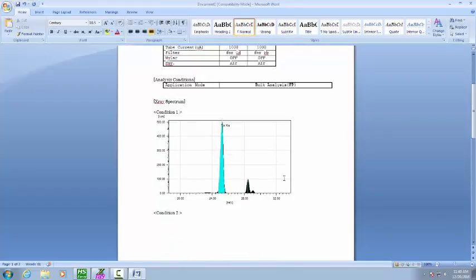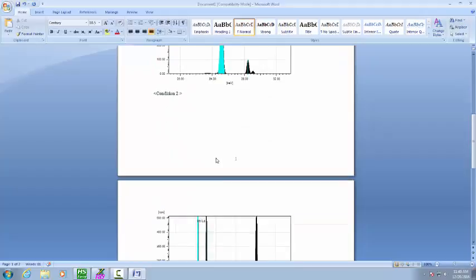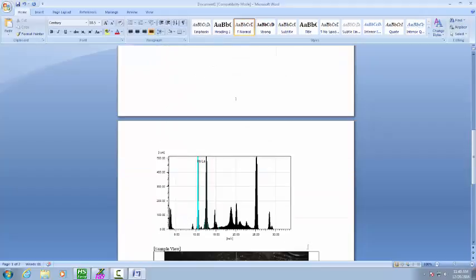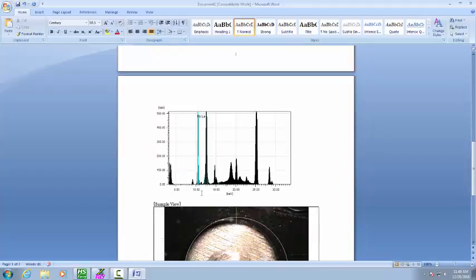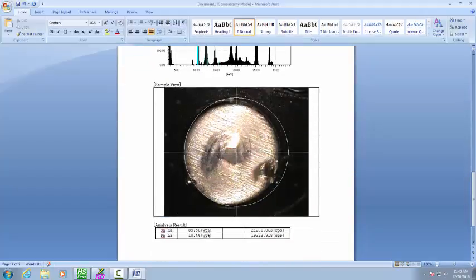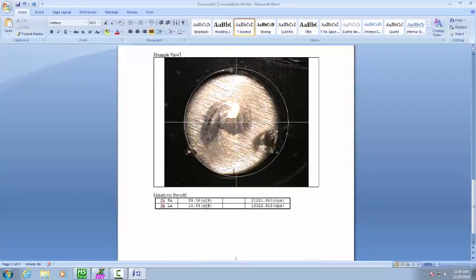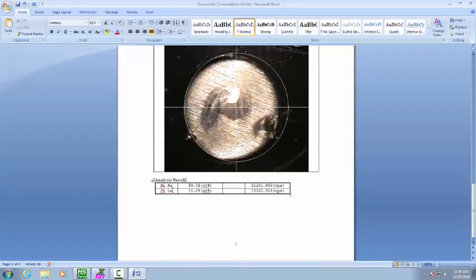Here's your spectrum for condition number one, your spectrum for condition number two. The sample image here shows you exactly where you measured your sample. And down below are the results.